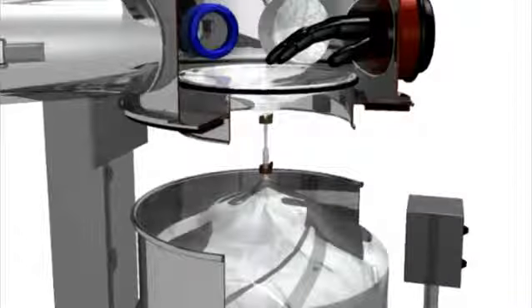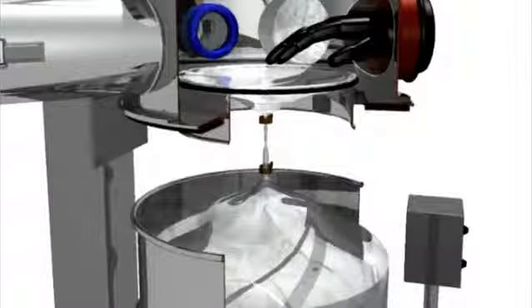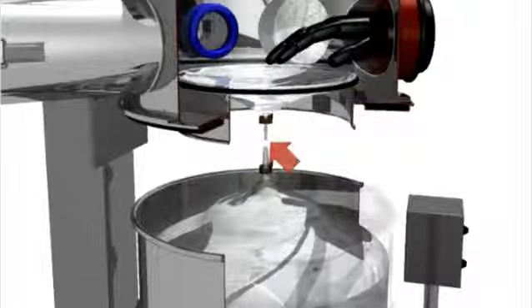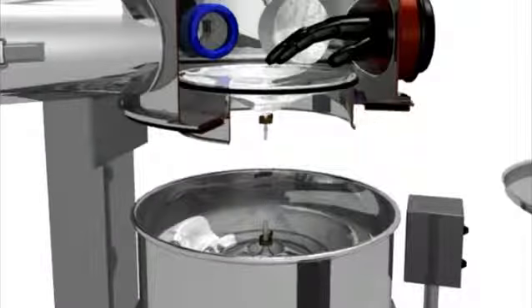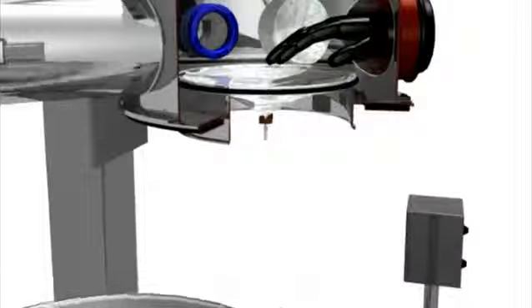The outer bag is then sealed using the Lugaya Safe Seal system. The new seal connection film is attached below the glove box ensuring full containment. Then the Safe Seal containment system is cut, which separates the liner from the DCS unit. The drum lid is placed on the drum and the drum is then removed from the system, ready for its next charge.